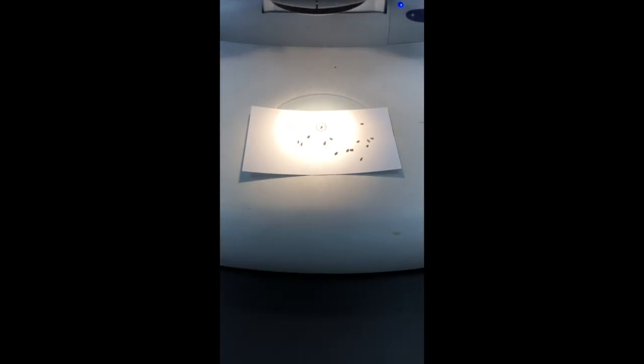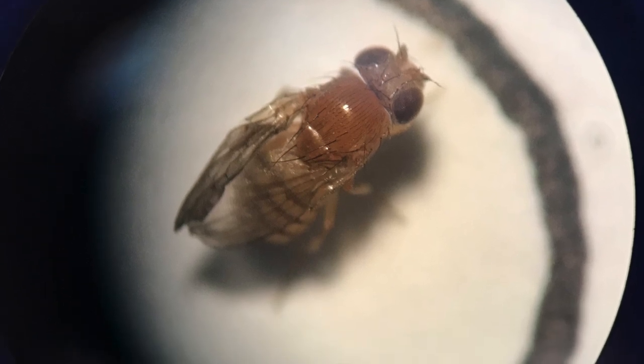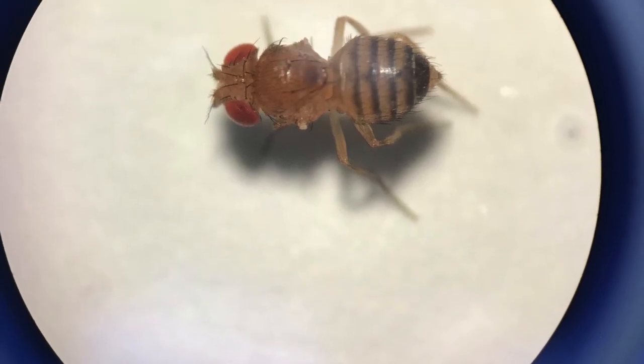Once the flies were extracted, each fly was sexed under the dissection scope. Once sexed, the number of flies were recorded as well as their phenotypes. These flies are a part of the F2 progeny and were the final progeny recorded for this lab.